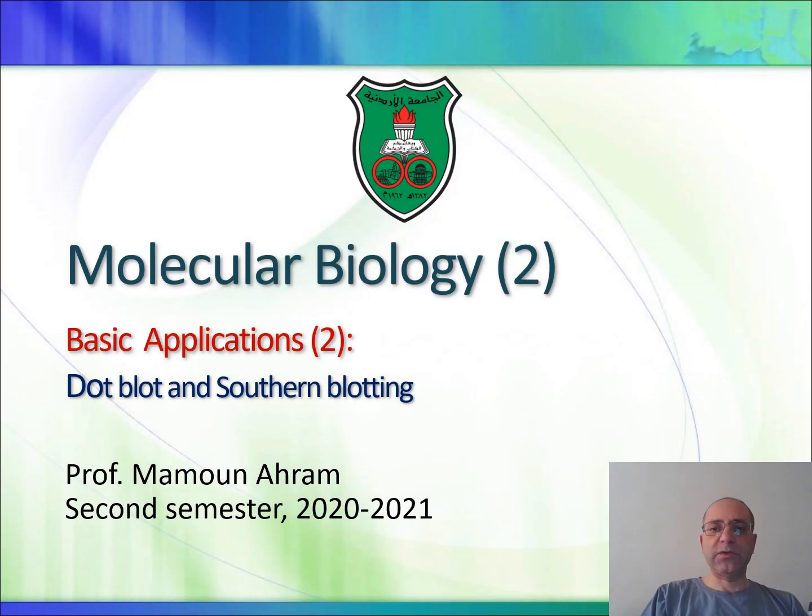Assalamu alaikum. So in this lecture, what we will do is we'll talk about two techniques. And these techniques are not used anymore as extensively as before. But if you understand the concept, and that's what I care about, it will help you understand a lot of things in molecular biology. So the techniques are known as dot blot and Southern blotting, or dot blotting and Southern blotting, whatever.